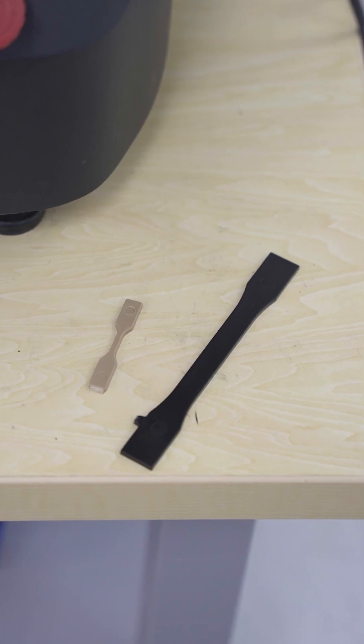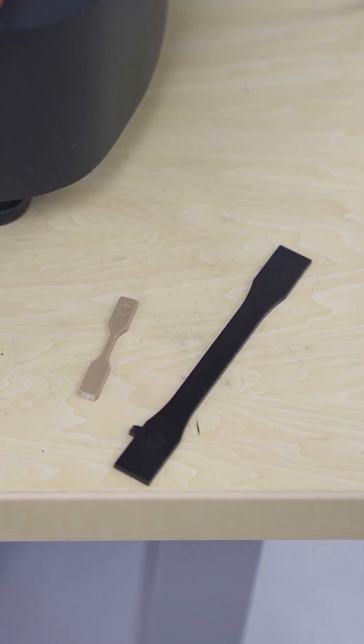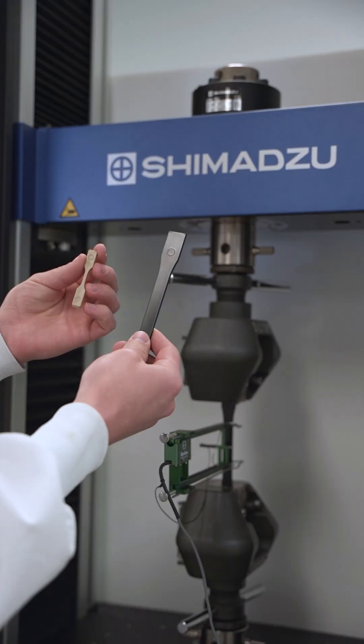There are five sample types with varying sizes and thicknesses. The samples have a dumbbell shape to ensure the break occurs at the center.